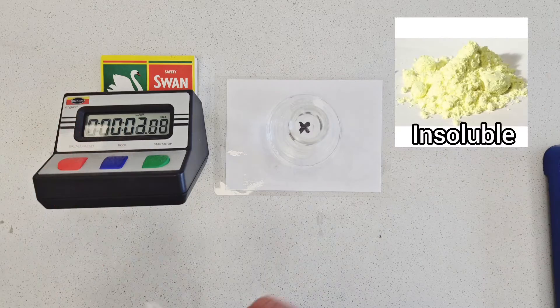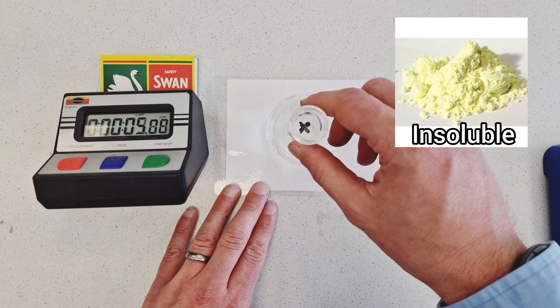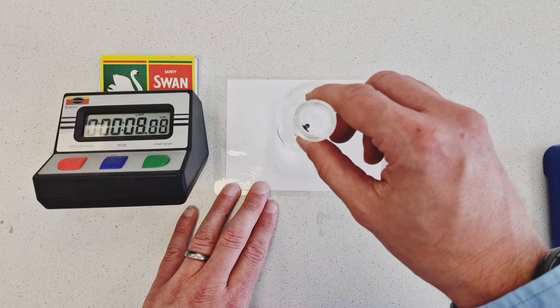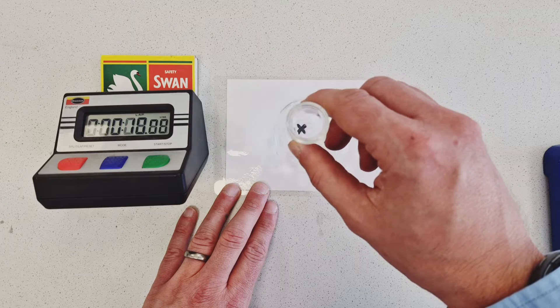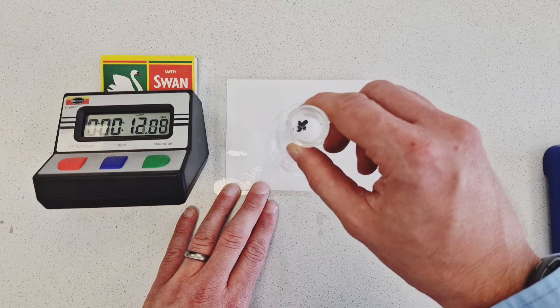Now, you may remember that sulphur as an element is a yellow solid, so what happens over time is a precipitate will form and a cloudy suspension will be created as the reaction goes to completion.